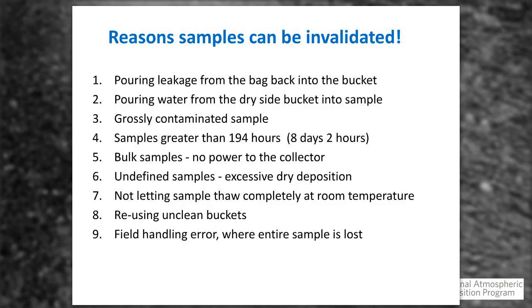The triggering of the Aerochem is affected by the grid sensor, whereas the optical sensor is a lot more sensitive. So operators will want to know the moisture content of what you're getting, as far as the precipitation can affect your collection efficiency, where it will affect the sample not being within the 5%. If you want to take that amount and measure it, let it melt at room temperature. Don't put it next to a heater or anything like that. We want it to melt naturally. And the same goes for your wet sample: let it melt naturally, weigh it, and maybe make note in section 10 on your field form that you had this much precipitation in your dry bucket. Once again, please do not introduce this to the wet sample in any capacity.